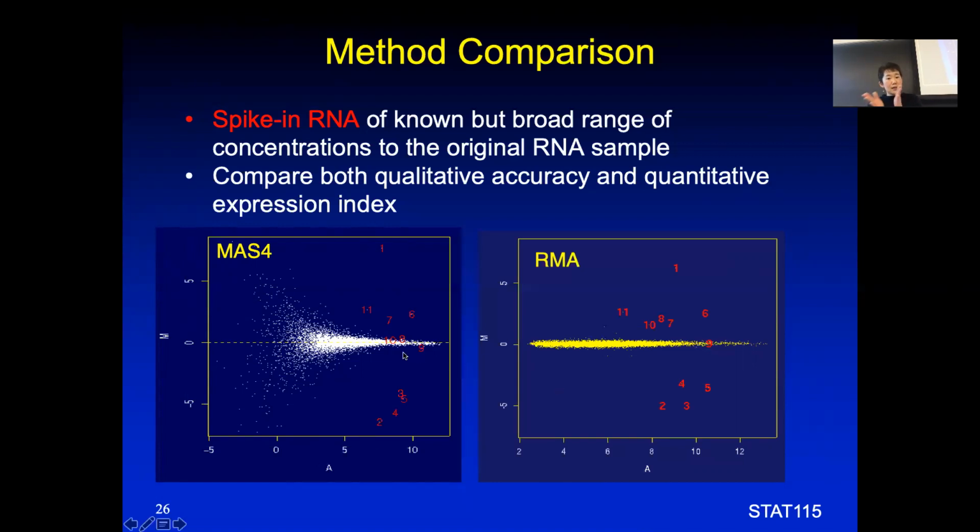And so you compare the samples. So the original sample plus the original sample with a few of the spike-ins, okay?